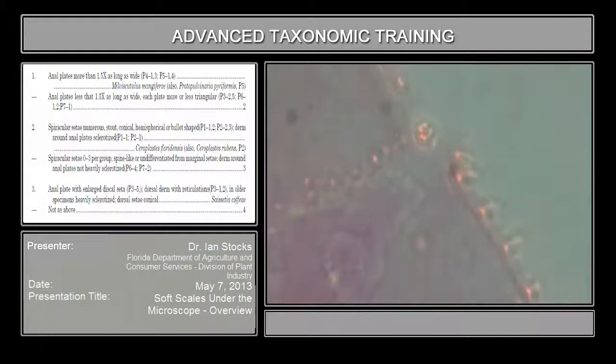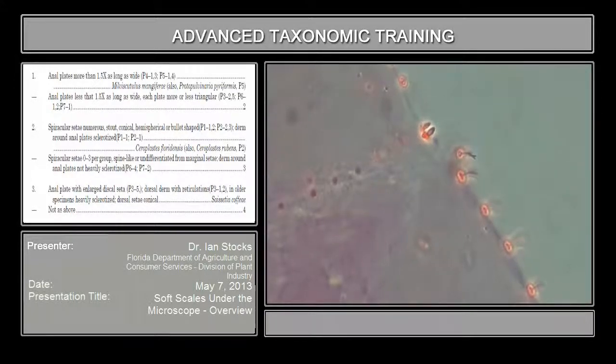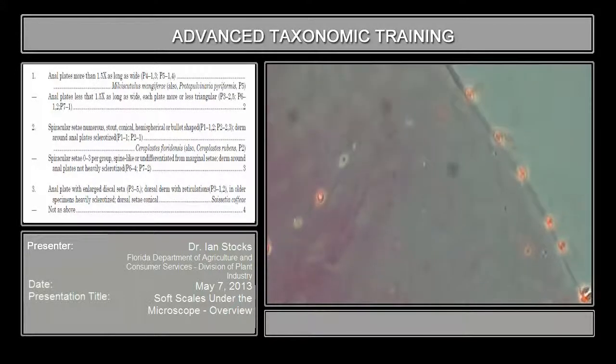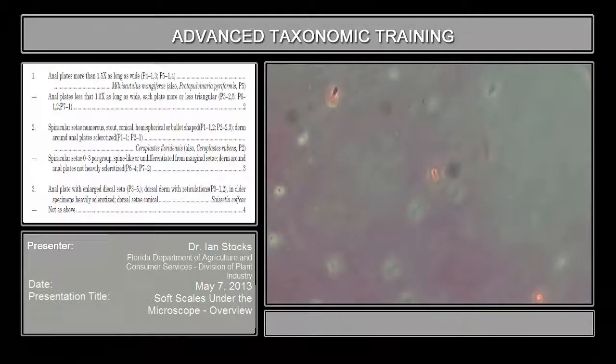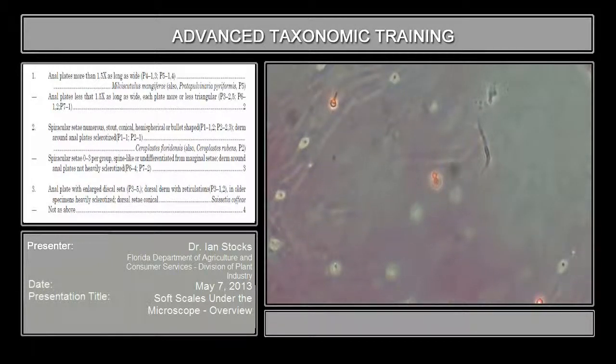There is a little bit of micromorphology about their actual structure that can be important, but it can be a difficult structure to get much detail on. So we'll run across those further in the key.